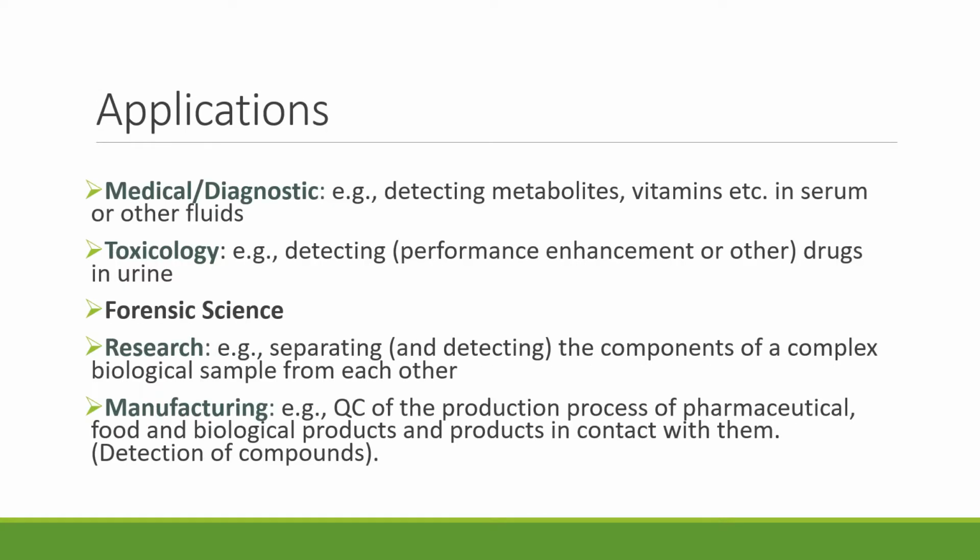Then some of the applications for the different chromatography techniques: we can apply these in biomedical engineering to medical diagnosis, trying to diagnose different metabolites, vitamins, even looking at serum.